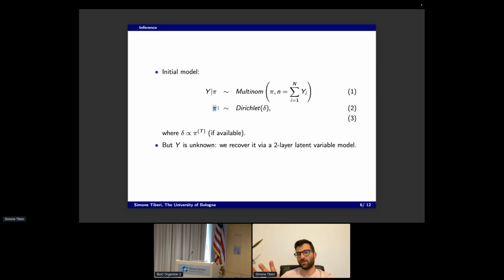So we don't fix it, we just push this abundance towards the transcript information. Now, this would be the end of the model if we actually knew the overall abundance of every protein. But as I said before, the actual challenge is that we don't observe protein abundances, we observe peptides. So the challenging part is that we try to transfer peptide abundance to the proteins.